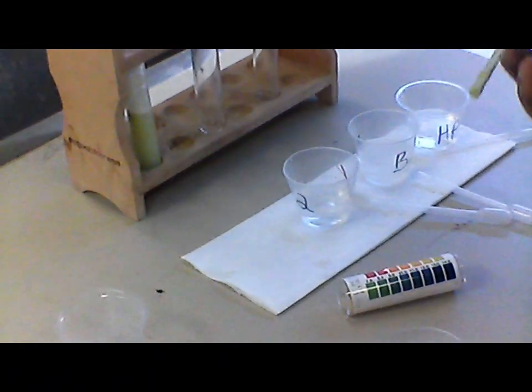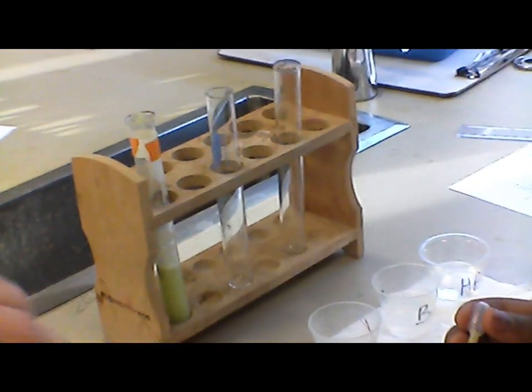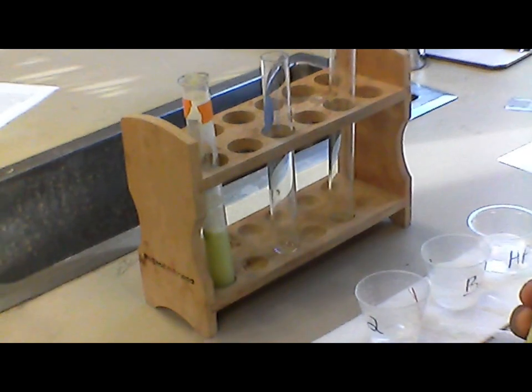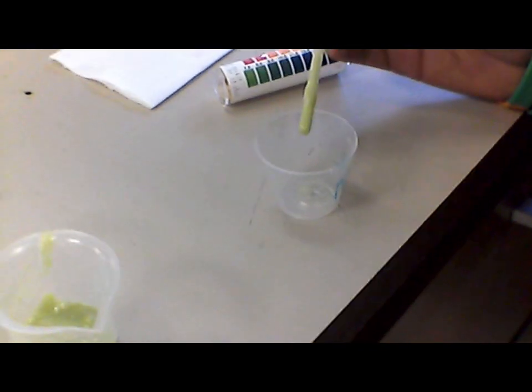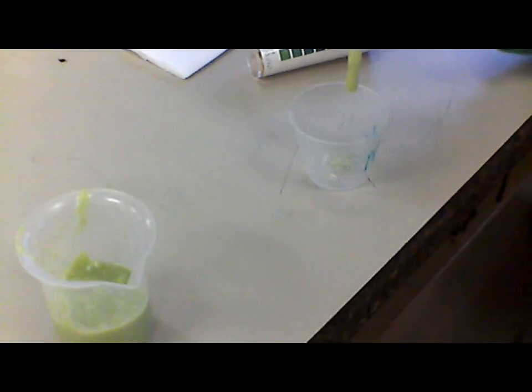So it says to put 30 drops of avocado into an empty medicine cup? Yeah, that's these two. You use that one for the vinegar and this one for the baking soda trial. You can use more than 30 drops. I think they use probably a much bigger dropper.